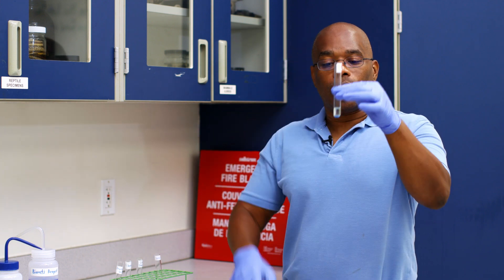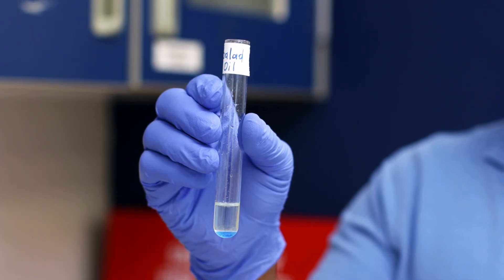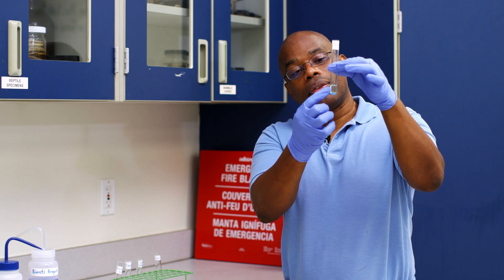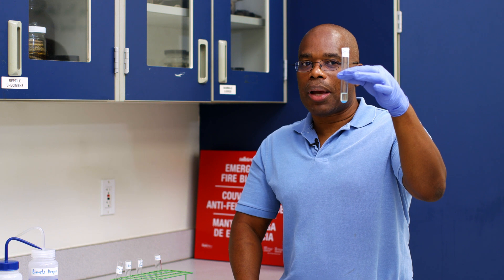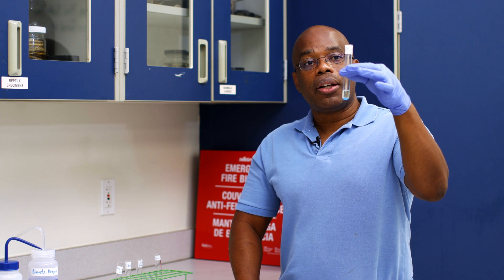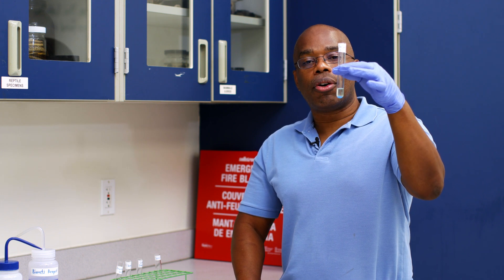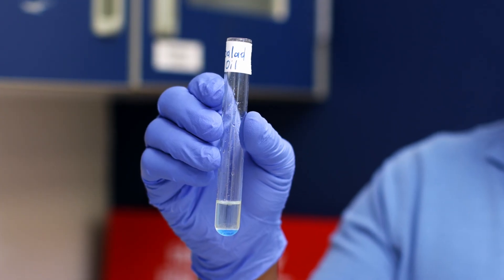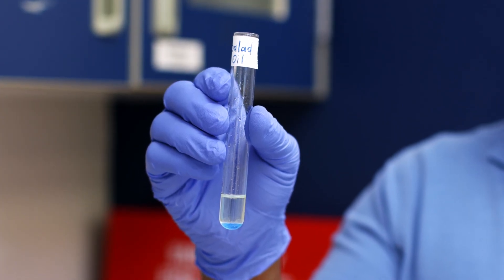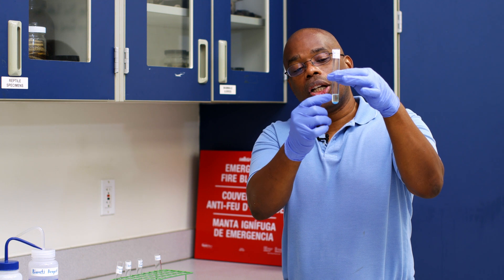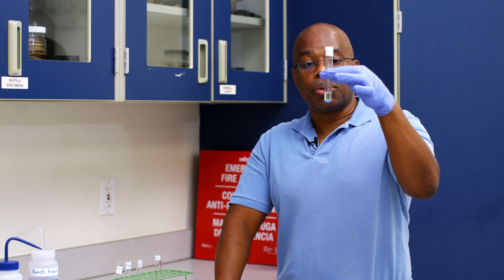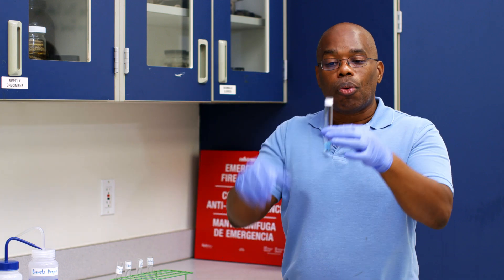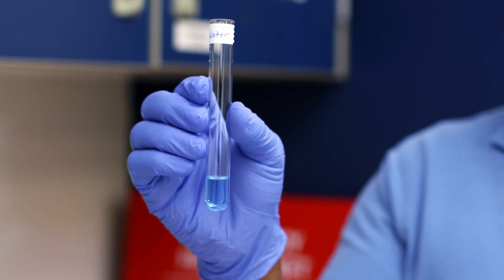Salad oil — again, no purple color. But notice that we got separation. Remember, we talked about how fats and oils are hydrophobic, so the watery part of the solution separated from the non-hydrophilic portion. And finally, water, which is also a negative control.